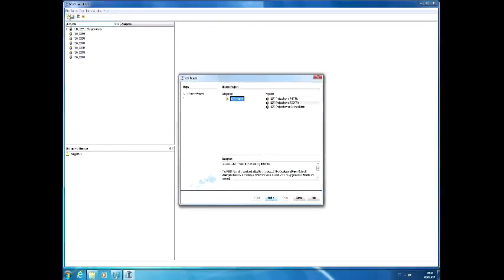So in order to create a new project, just click here, New Project, and we create it from an IHIT file. You can also create one from a root file. This is if you already had a project somewhere else. So you can copy the entire project folder to a new computer and start a project from a root file, which then contains all the analysis that you've done before, which obviously is a pretty handy thing to be able to do. And I think you can do it from an existing old analysis folder as well.